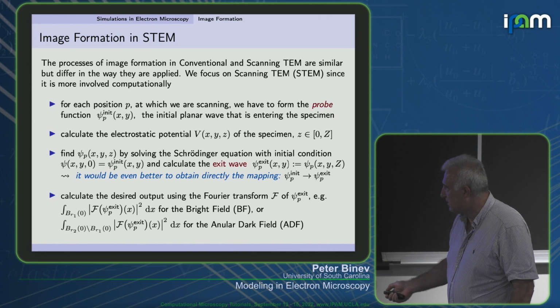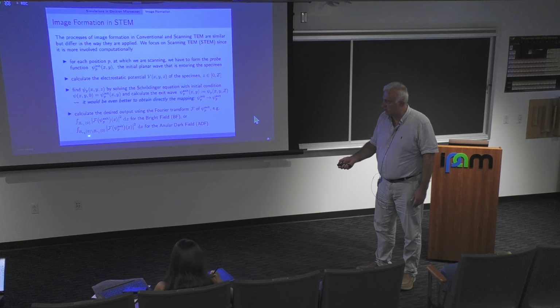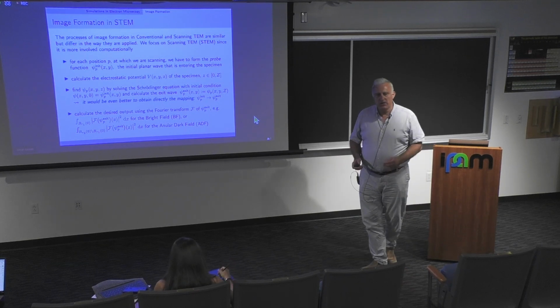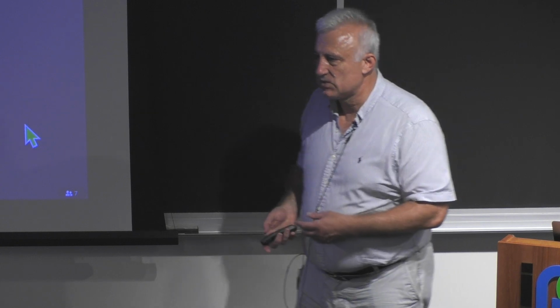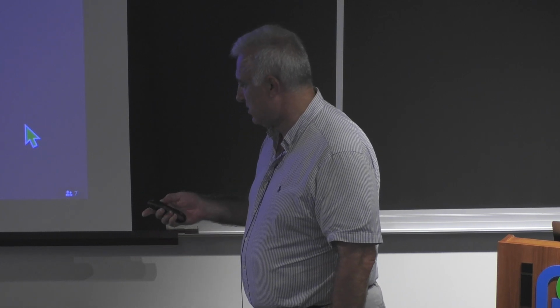And if we have annular dark field or high angle annular dark field, that depends on the radii R1 and R2, whatever we say, that we take. I believe if we have 4D microscopy, there are also formulas which describe each pixel, how to calculate that. So that is an important calculation, this one here.